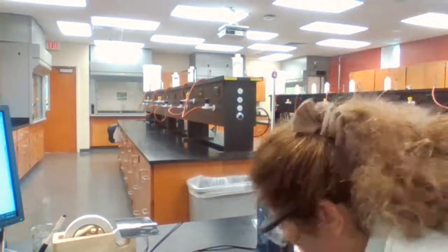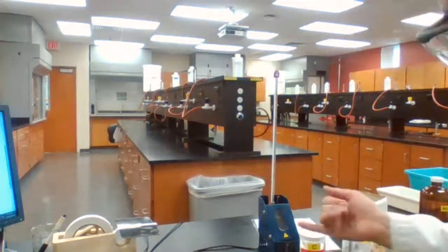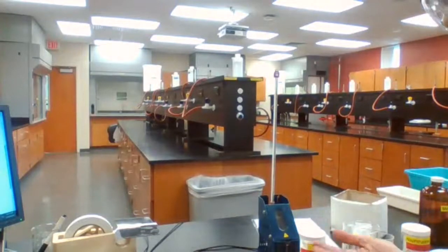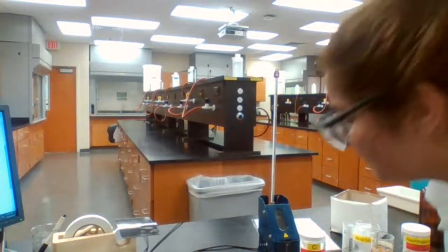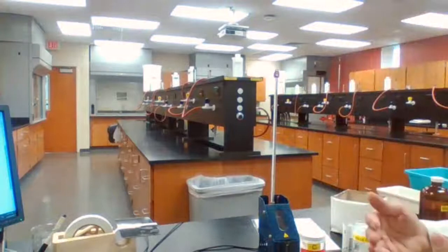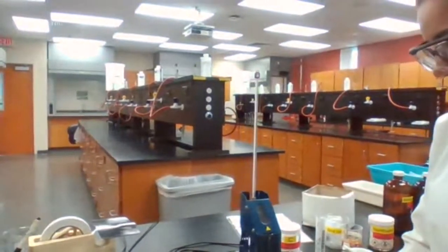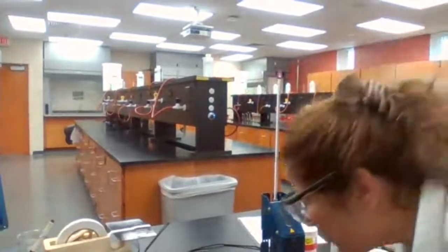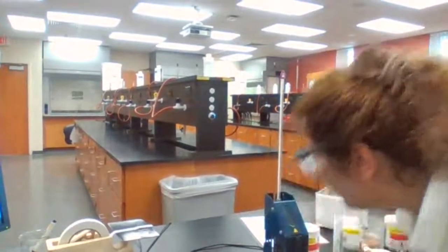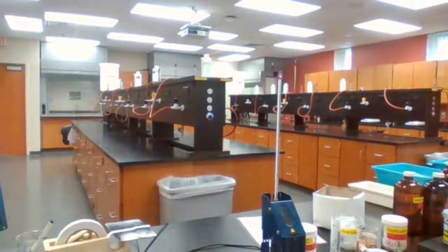I try to bring the camera close enough for you to see it, but if you don't see it, just trust me. I'm going to read the exact number, regardless of whether it gives some error or not. Every experiment has some experimental error, so it could be from me or you. The point is that we read and trust the numbers that we actually get from the experiment, and we take those numbers with some degree of error. But sometimes we get an exact number, not always with the error. Okay, so now the temperature is increasing.